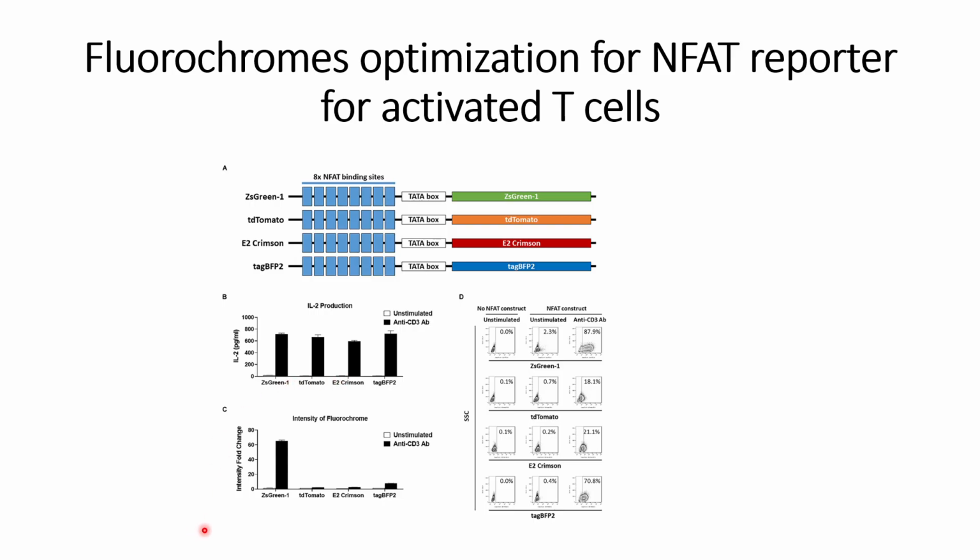Then they checked the intensity fold change of the different reporter proteins, and the fold change is compared between unstimulated and anti-CD3 antibodies.